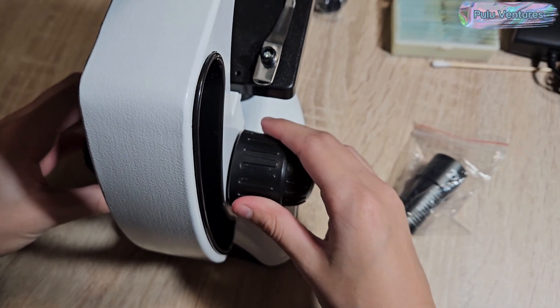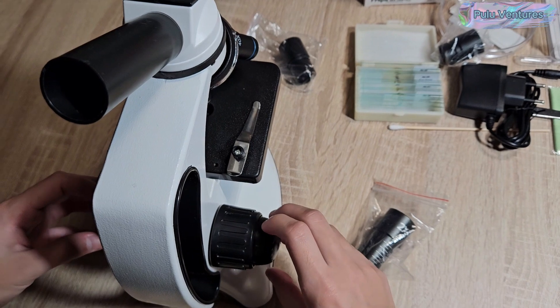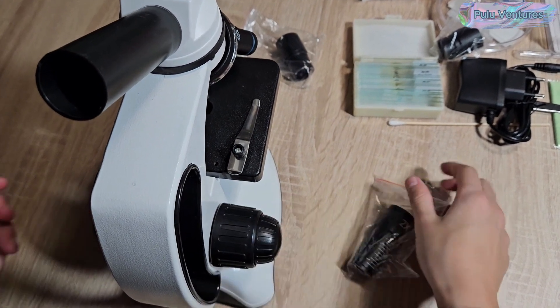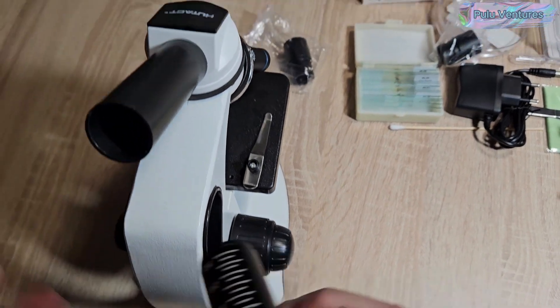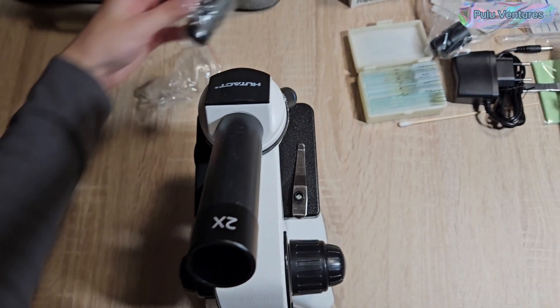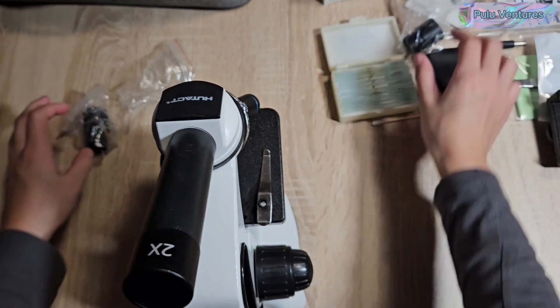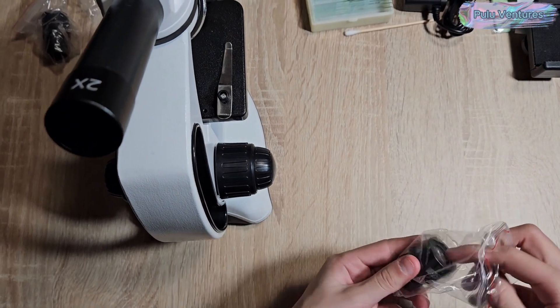Remember that the ocular lenses multiply when combined with the objective lenses and then the multiplier lens — it is always by 2. In other words, a 25x ocular lens together with the 10x objective, as used in the example, would give a magnification of 250 times. And when combined with the multiplier lens, it would give us a magnification of 500 times.